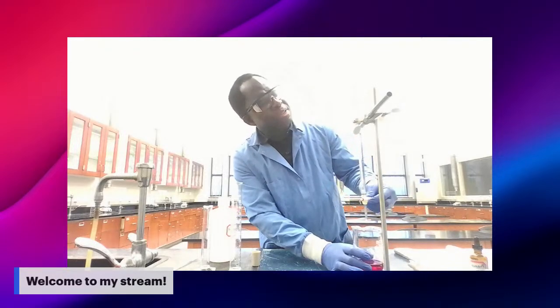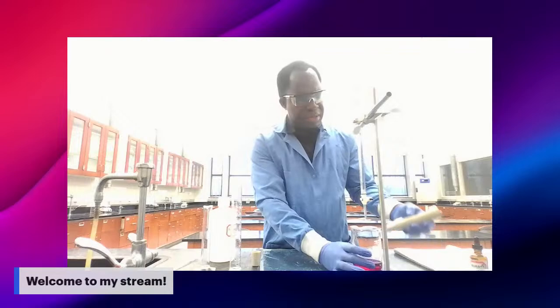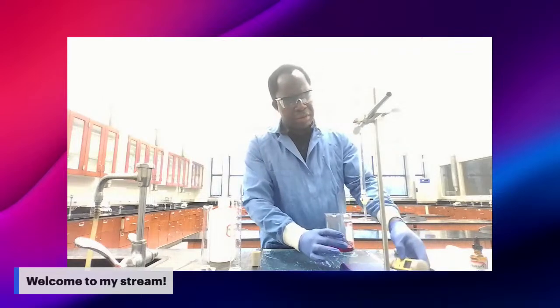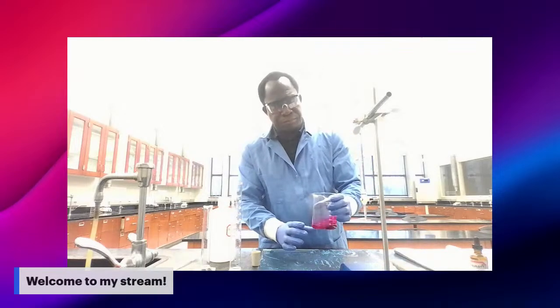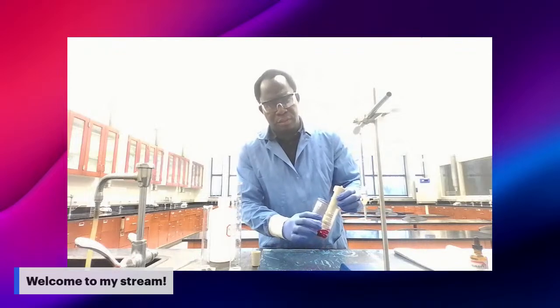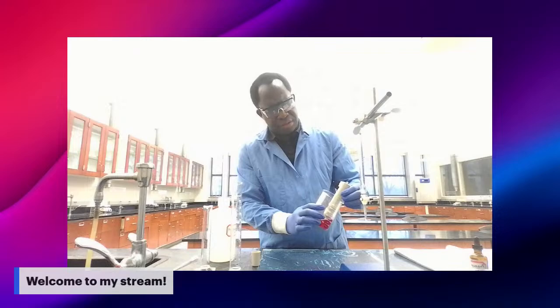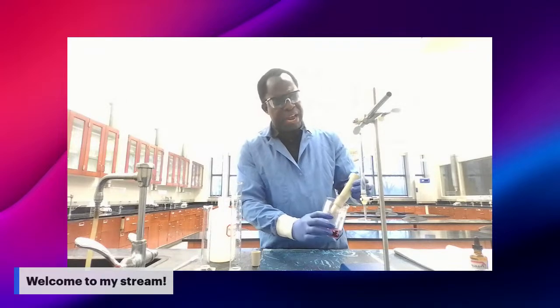I'm going to add another increment of 1 milliliter. So you have a pH of 10.9.